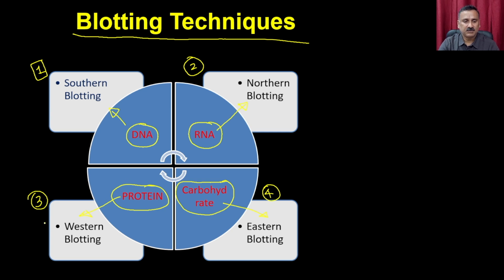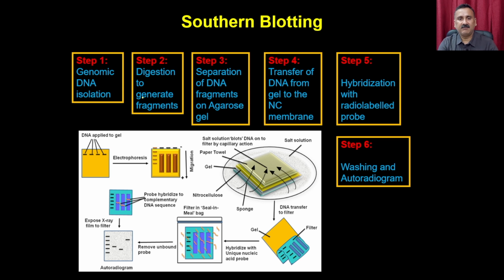then we are going to discuss Western blotting. When we discuss these techniques, we are going to talk about the basic principle of the technique, the underlying mechanisms, and how to perform the particular technique. So, let us start with Southern blotting.